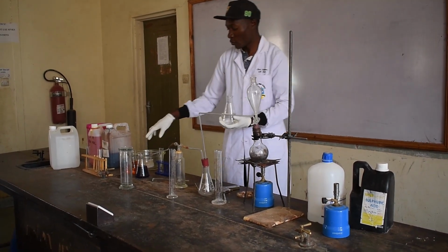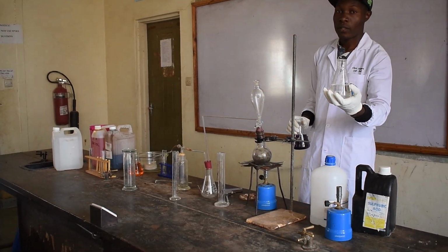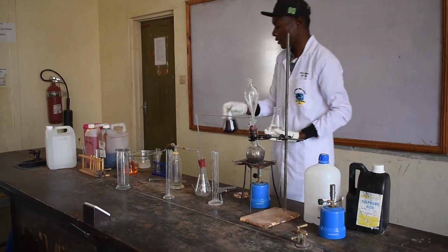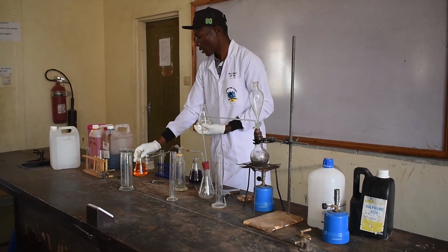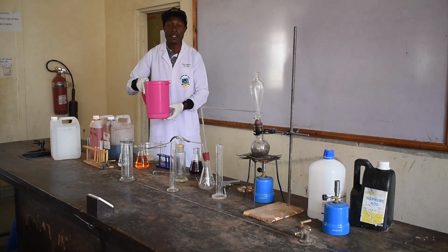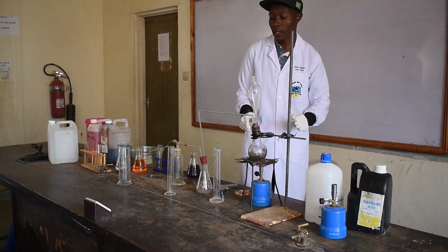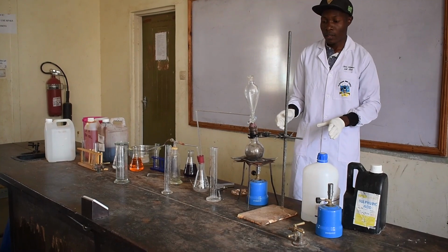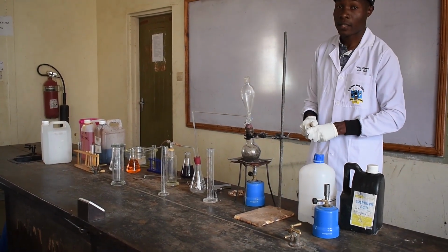We have here 3 solutions. One is sodium hydroxide solution, another is acidified potassium permanganate. We have acidified potassium dichromate. We have water. So these are the basic apparatus that we are going to use in preparation of ethene gas. So without so much time wastage, let us start our preparation.